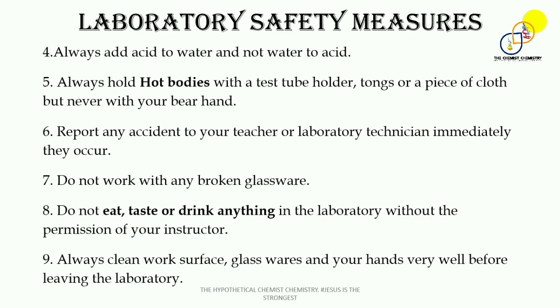What happens is that when you add the acid to the water, there is this explosion, but it takes place at the bottom of the water, and so the water serves as a shield from the splash. But when you do the opposite, the splash takes place at the surface, and it can cause severe damage to you. So take note of that.